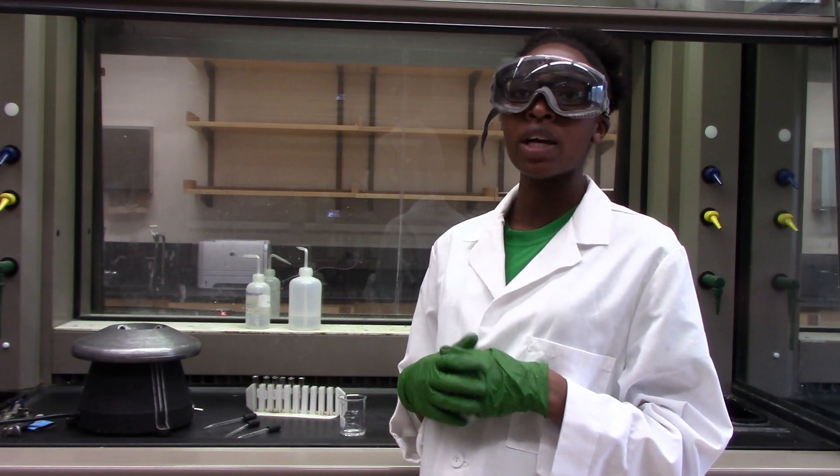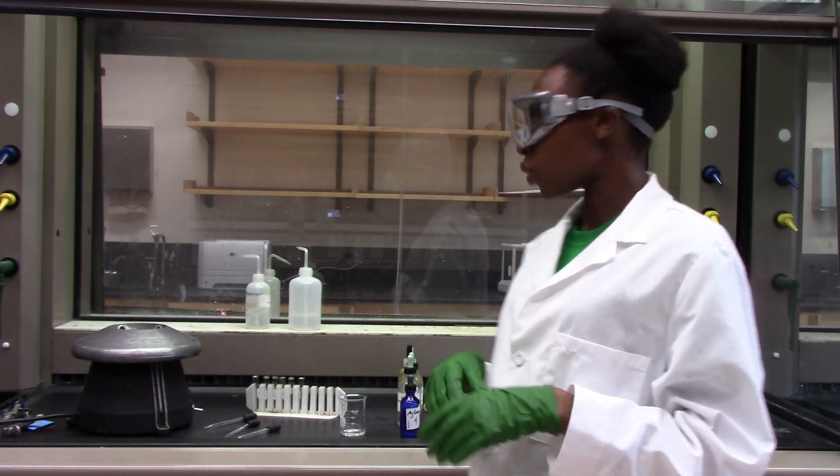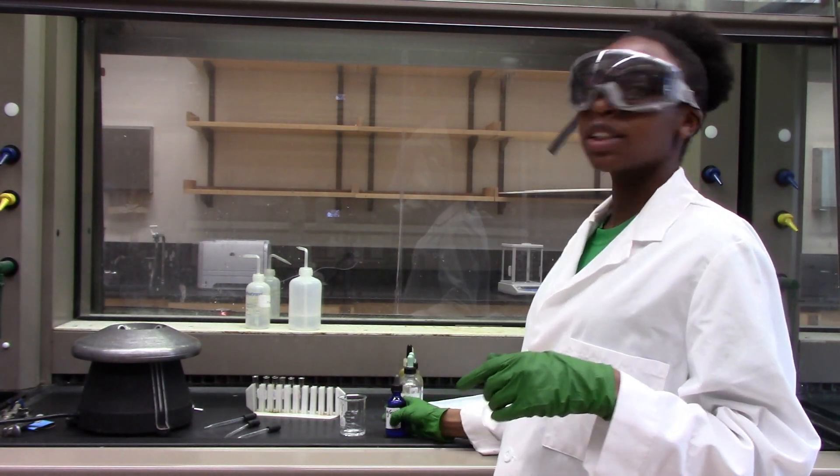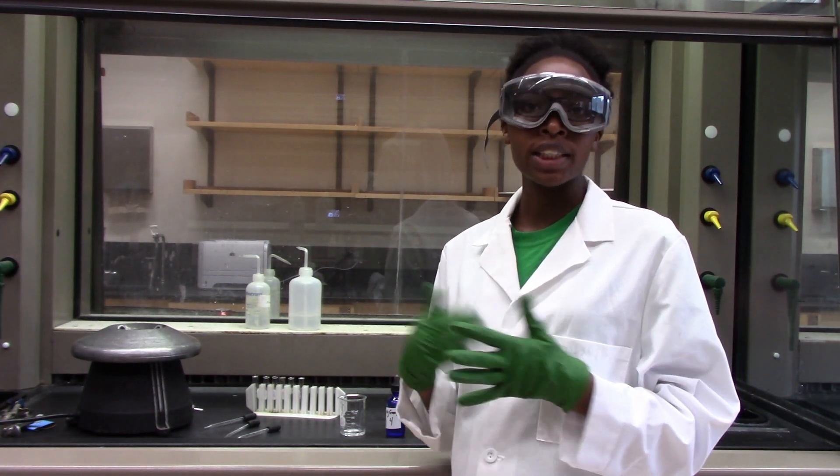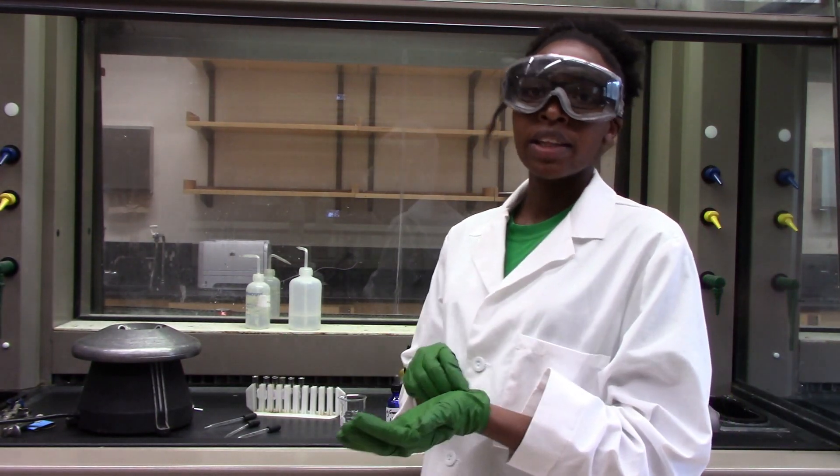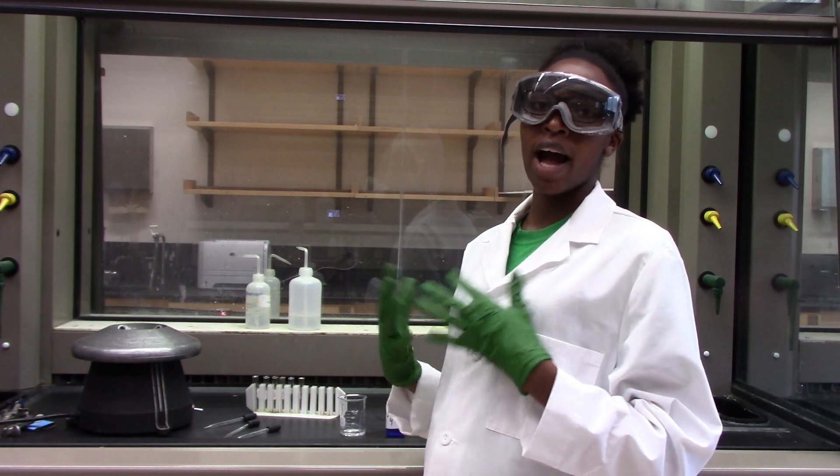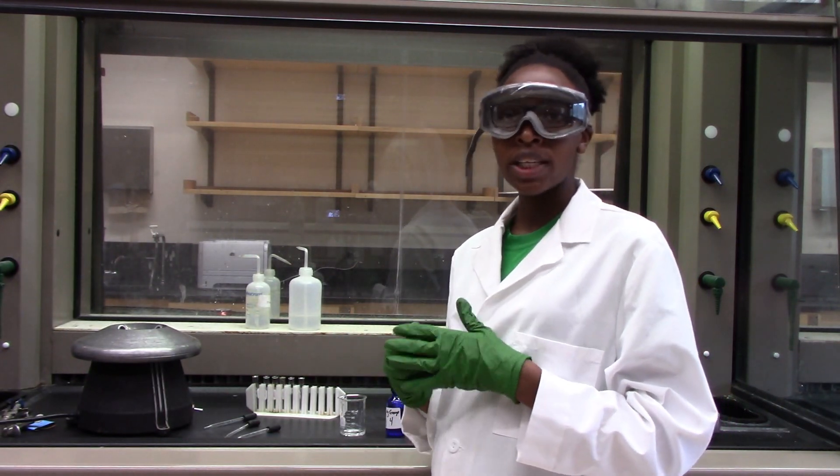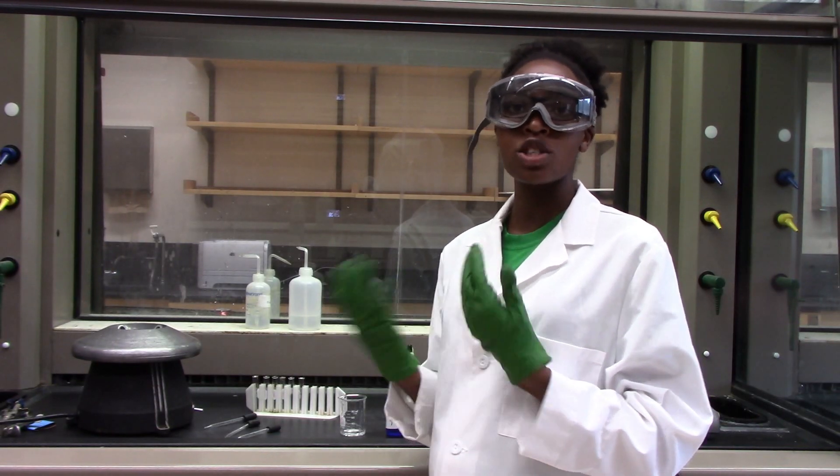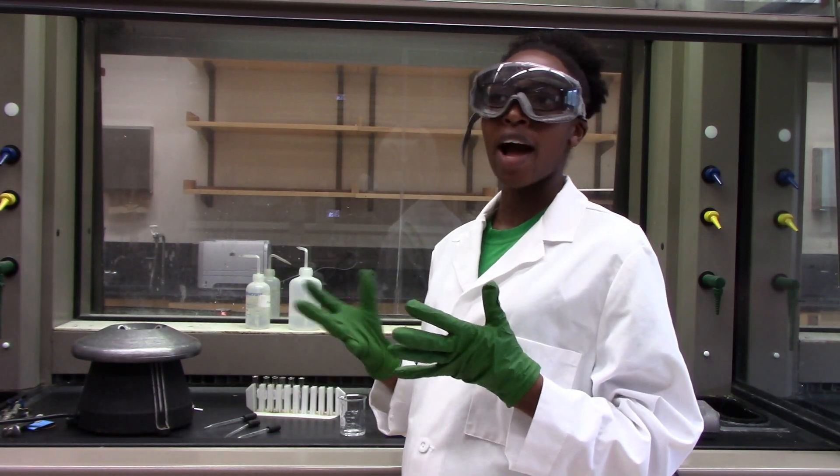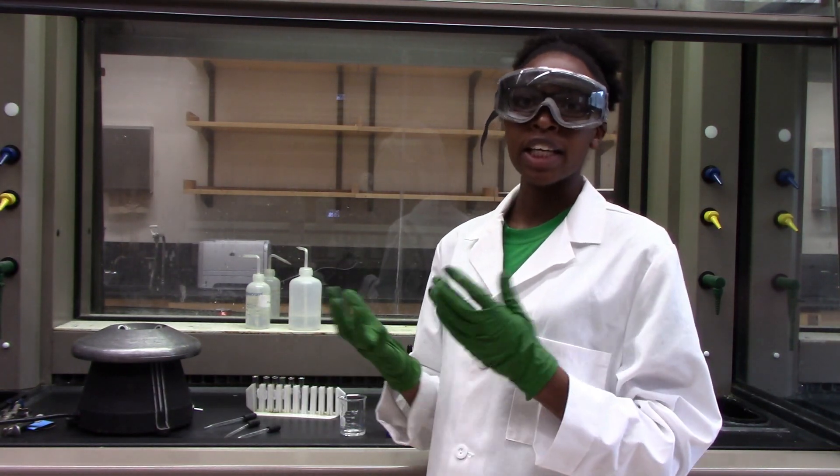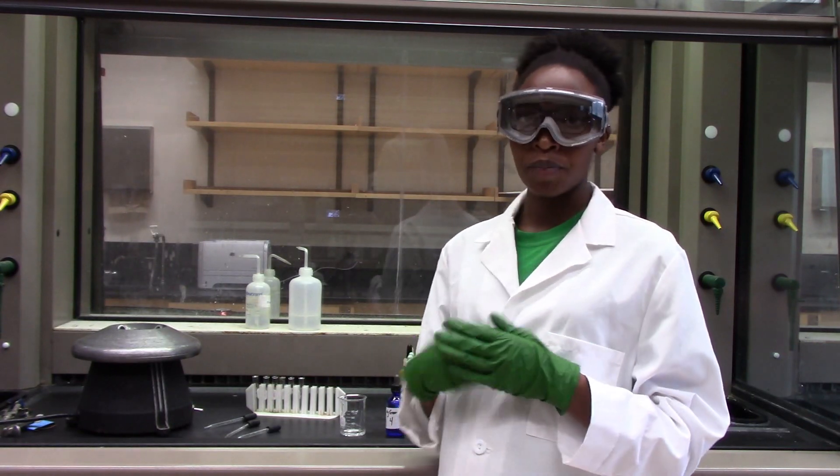Today we are just interested in knowing what is in a solution. We are given an unknown solution here and we are supposed to find out what cations are in there. Silver group cations are called a silver group because they have one thing in common. They are all insoluble salts, all their chlorides are insoluble. Therefore, if we have any chloride in the solution, it should precipitate all of these cations.